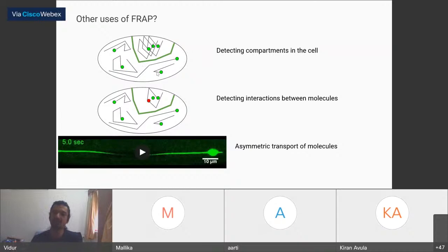So what you have is something which is from left, right, up and down. However, in my case, since I'm using a neuron, a long neuron throws a process which is long and slender, and this neural process is just at the resolution limit. So inherently, when you photobleach this neural process, you don't have any up or down recovery. You will have only left and right recovery.